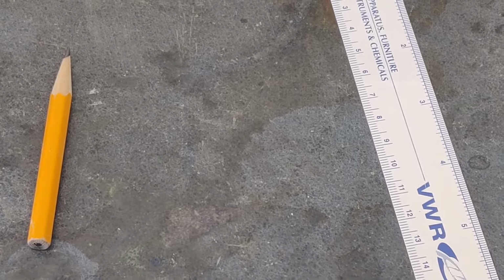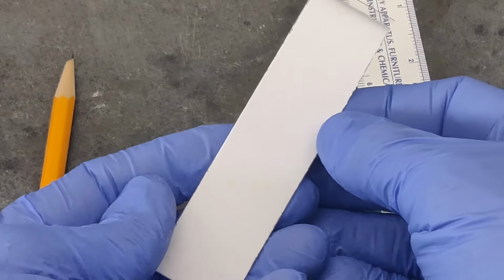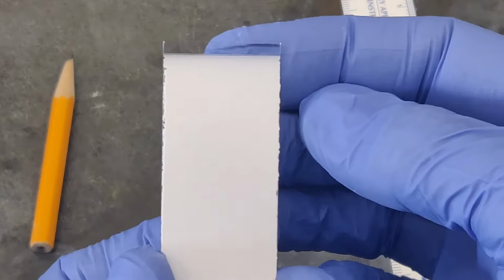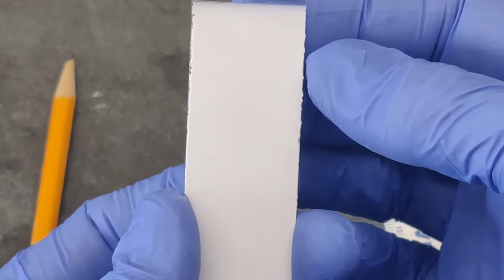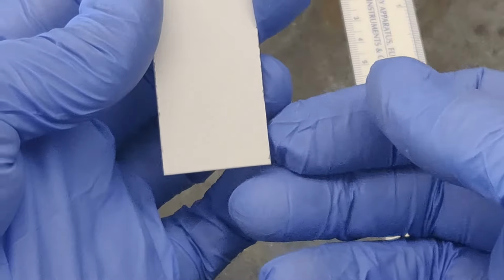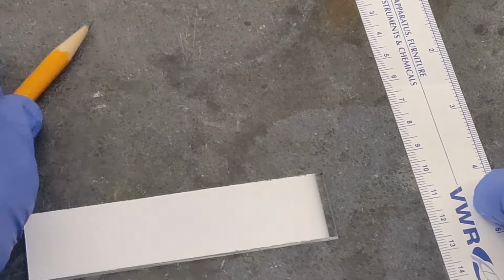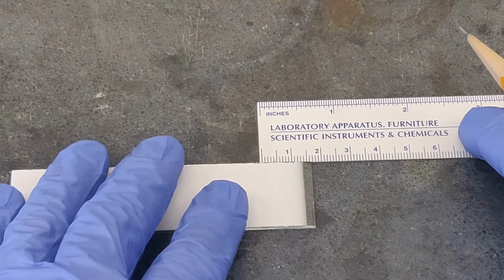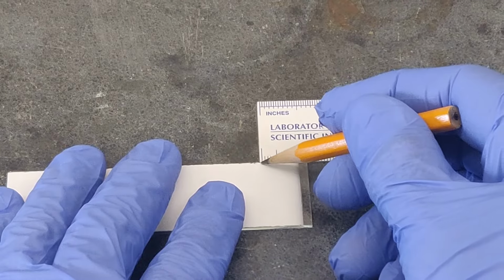What follows is a demonstration of TLC co-spotting. First, obtain a small silica gel TLC plate. The plate will most likely have one short end where the silica gel doesn't reach the edge of the plate, and another end where the silica gel coating extends to the very edge of the plate. If so, at the edge with the exposed glass, use a ruler to lightly draw a straight line 1.5 centimeters from the edge of the glass.